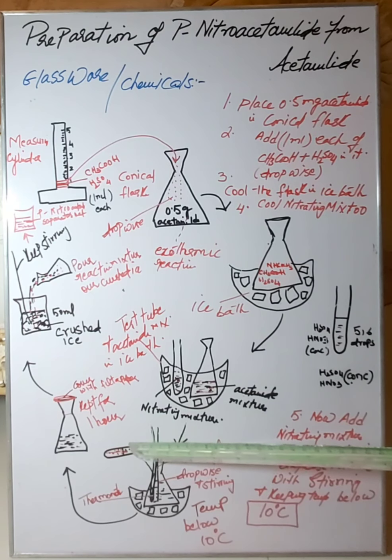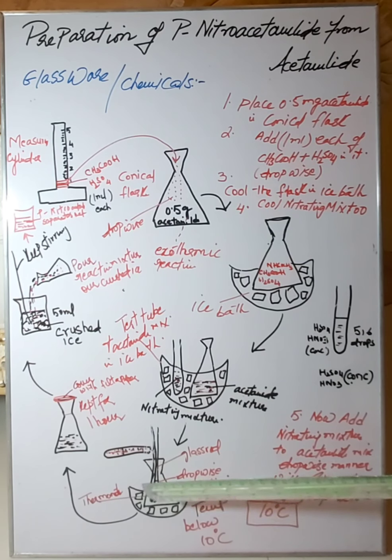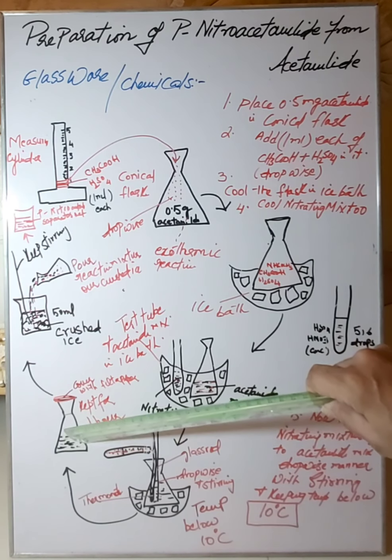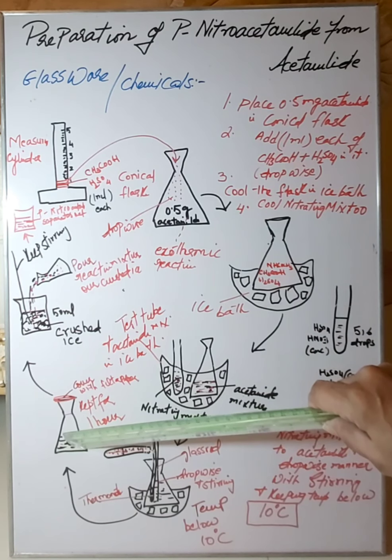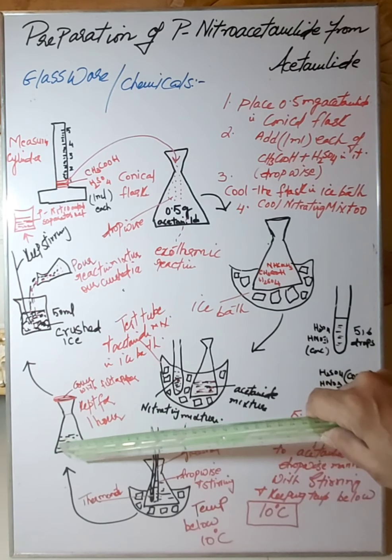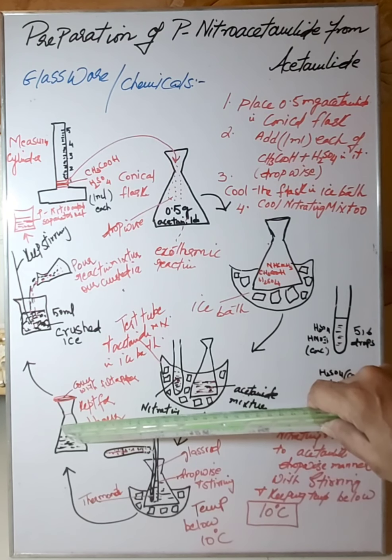Now the reaction procedure says that after you add up all the mixture, you have to remove the flask from the ice bath and allow it to stay for 1 hour. Now you will keep it out, and here you can see the flask. Cover it with a piece of filter paper and keep it for 1 hour. You can stir it occasionally with a glass rod, and cover it again.